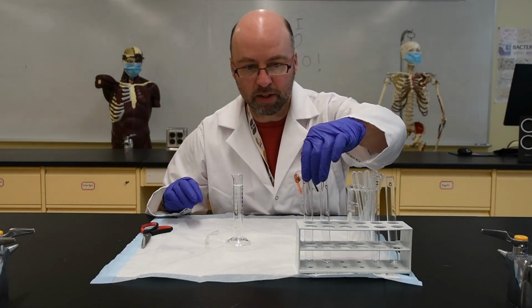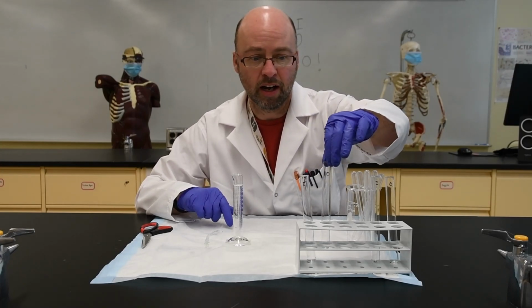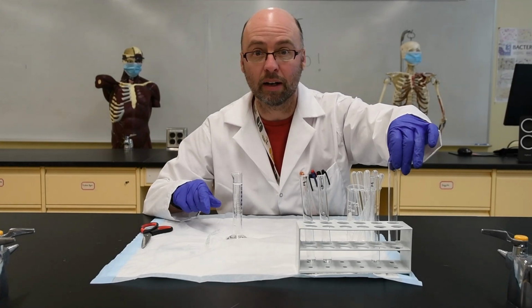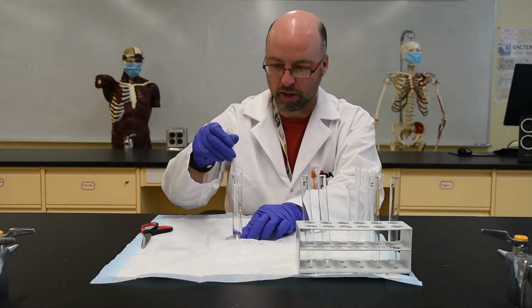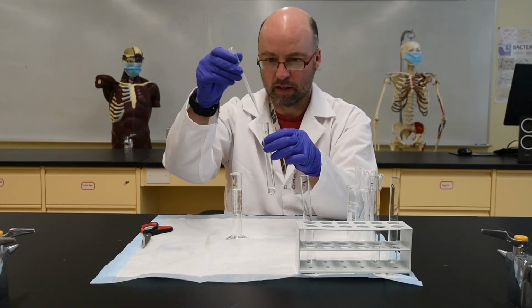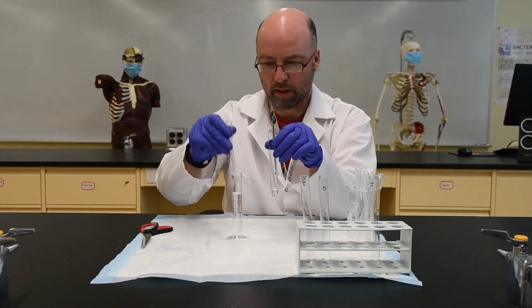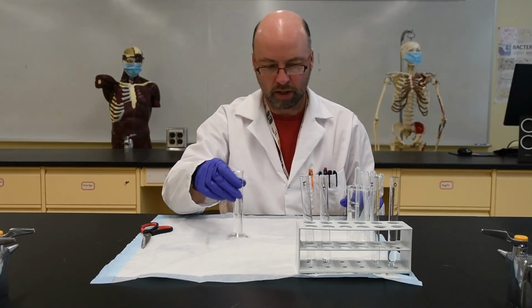I've got four tubes here: inside the bag to test for starch, outside the bag, from the flask, to test for starch, inside the bag to test for glucose, and outside the bag to test for glucose. I'll start with the outside one. I'll take some of this and add a little bit of it to a tube like that. So that's an outside. Here's the other outside tube. I'll take that one too, just a little bit like that, and put that to one side.